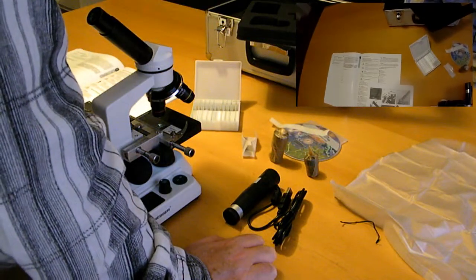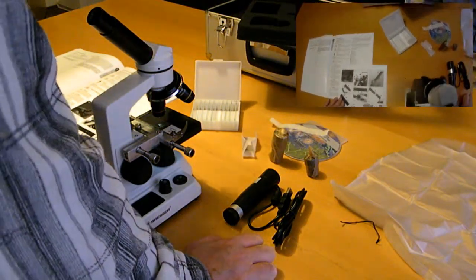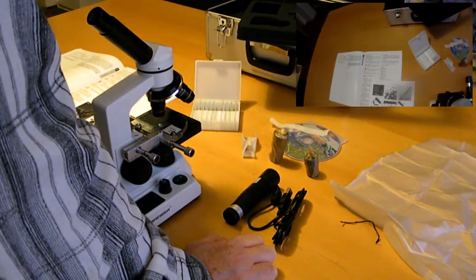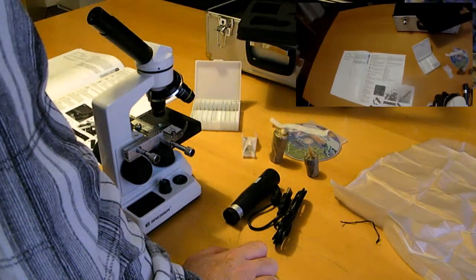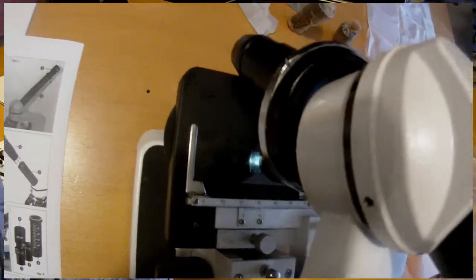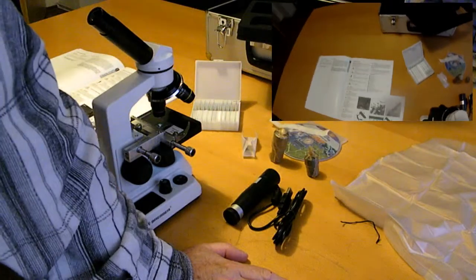Then we have the slide stage retaining screw, number 14. I don't find it. I think it's this thing here, to fix the slide stage. Slide stage adjustments, these are these two, forwards and backwards. And the vernier scale, these are the scales right here. We have to find out what units. I think it's millimeters here. But of course, how much it is here in the eyepiece, what you see, depends on the factor of magnification, of course. That's clear.